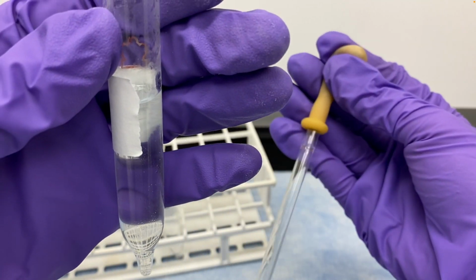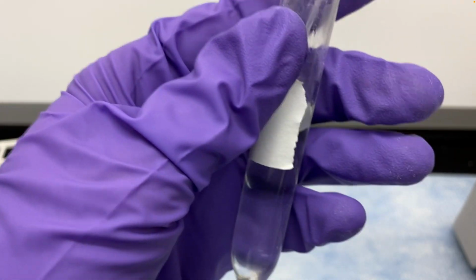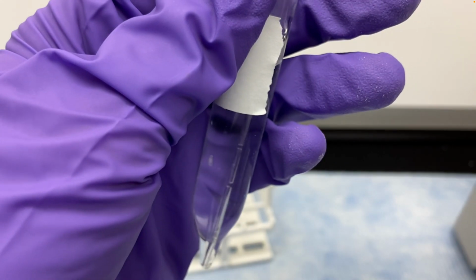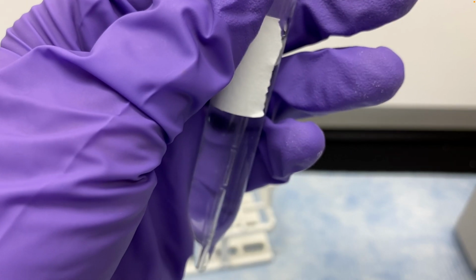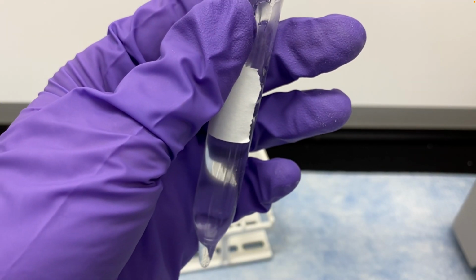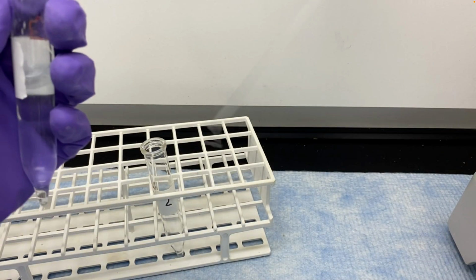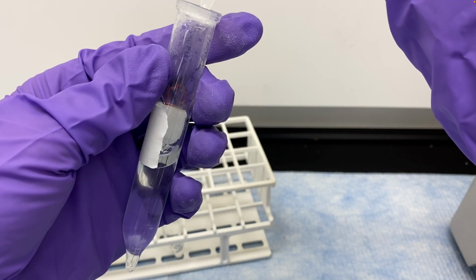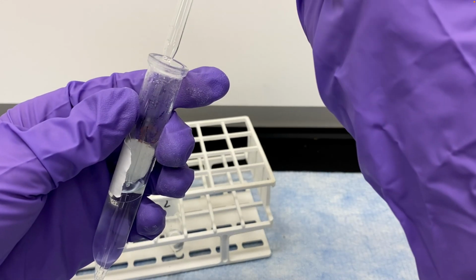So we just want the top layer, so we're going to remove the bottom layer. You'll squeeze the pipette and put it all the way at the bottom where the tip is of the centrifuge tube. This is why we're not just using a test tube, we're using a centrifuge tube, so we can really control how we get the bottom layer out of this. We want the bottom layer removed, but not the top layer. So you'll take that up and then squirt that into your second centrifuge tube. And you'll keep doing this until the only thing that's left is that top ethyl acetate layer that has the camphor that you want.